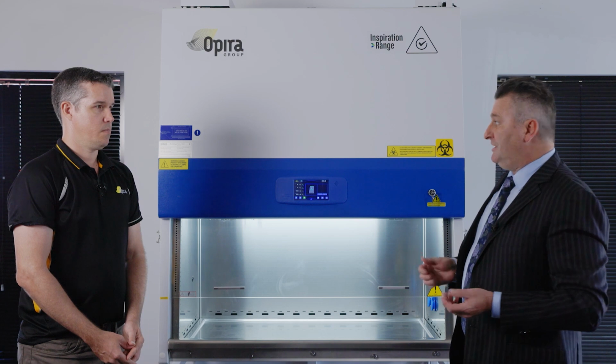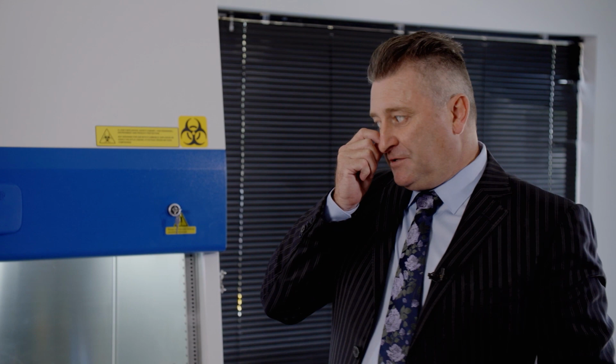So that's everything you need to know about testing a Class 2 cabinet, and thanks Curtis for your help, and I hope you've got some value out of it. I encourage you to go and talk to your technicians when they're doing these tests and at least witness the barrier test, because it's actually quite interesting, and we're the only country in the world that do it, much to the dismay of many foreign standards committees and cabinet manufacturers, but it's a very good standard, and it's the one that's going to tell you how safe you are. So go and have a look at it and learn about it. Thanks very much.